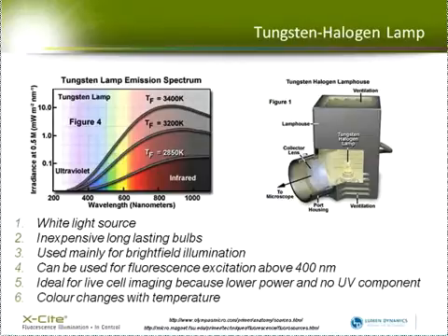And you need to be aware that the color changes with temperature, especially if you're doing any quantitative imaging. You want to make sure you use it at the same temperature each time.